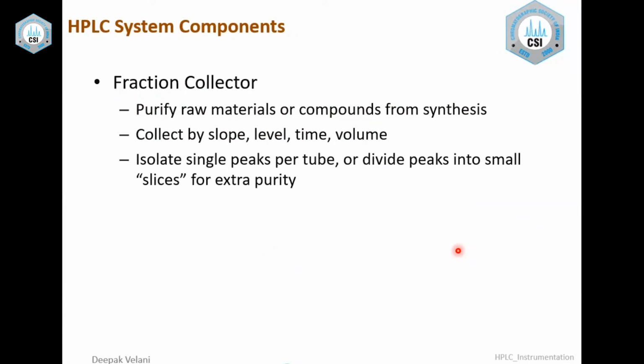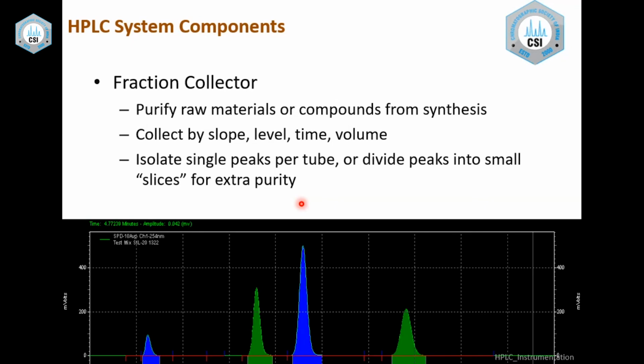Along with this HPLC, the benefit is that we can have a fraction collector, which can help us in collecting the fractions after detection. Of course, in the mass spectrometer, a diversion has to happen because the complete volume cannot pass through. But we can collect the fractions at a low level or high level, from microgram levels to milligram or gram levels, and that can be used for characterization. That can be used for R&D purposes, and when it has to reach the level where we have to synthesize certain things, it can go to the production level also. This is the fraction collector, which I have not shown in the earlier photographs of hardware, but it is a very useful tool and gives a big advantage. All upscaling from analytical to preparative levels can be done with similar column selections. This is a kind of fraction collector.